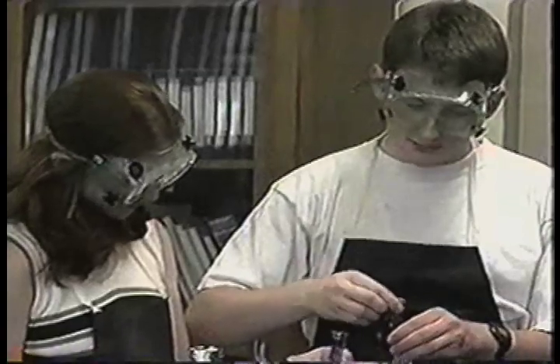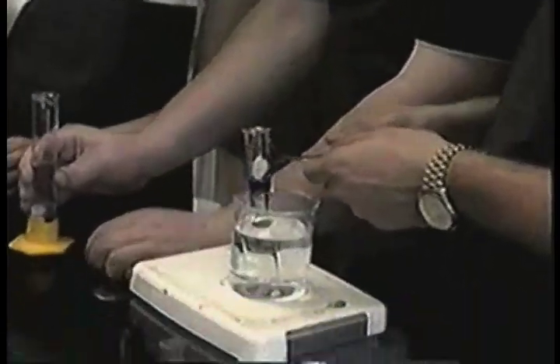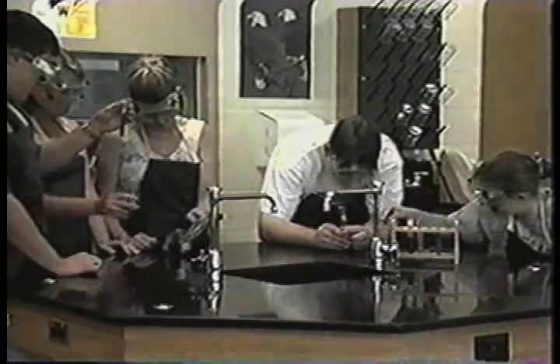It's a great place. Great things have come from laboratories. Chances are, some of your most valuable learning experiences will be in a lab, just like this one. If you learn to be safety conscious, you've already chalked up one valuable lesson. Five students wear goggles while performing experiments at a lab table. A sink is in the middle.